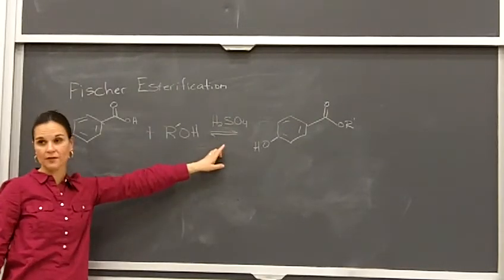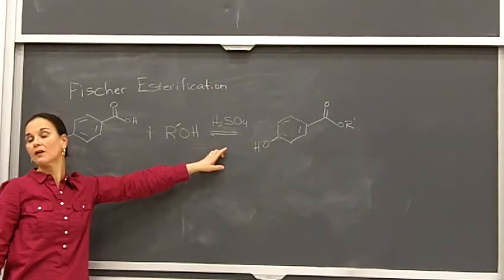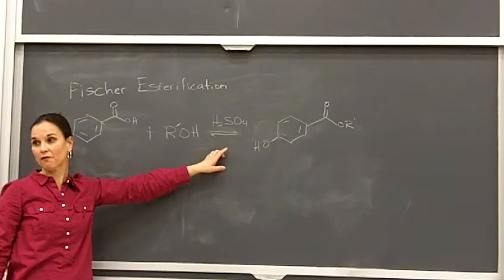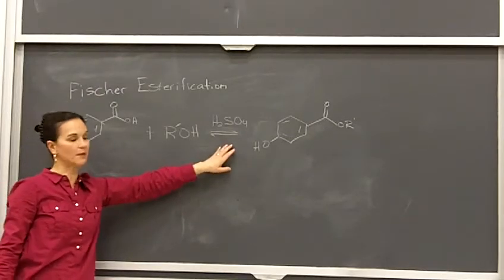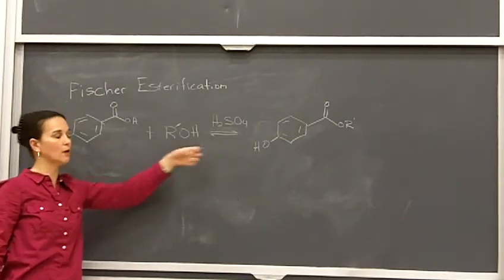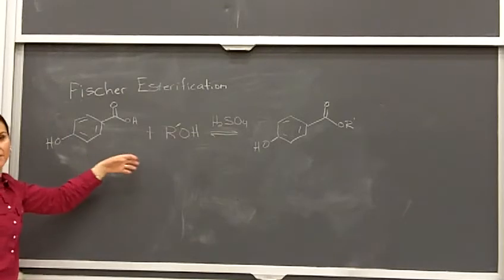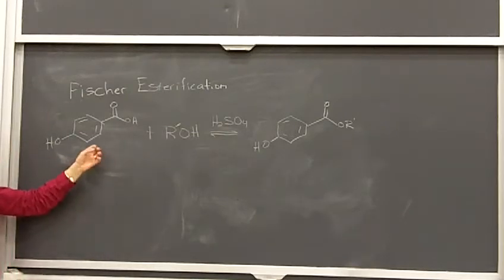So we use concentrated sulfuric acid, so be really careful handling the sulfuric acid. It is concentrated. You don't want to get it on yourself. Wear gloves with it, okay? Keep it in the hood, and if anything's spilled, let us know. We'll get it cleaned up. So we want to minimize as much, the least amount of water possible with the acid. And then when you're running the reaction, make sure what you're using is dry. You don't want to add water to your system. Make sure you have everything clean and dry for the reaction.